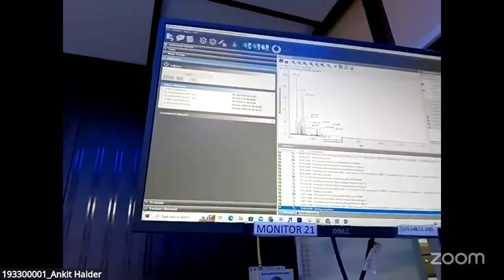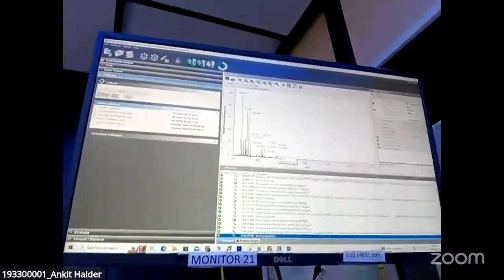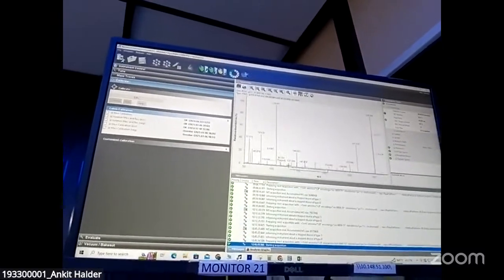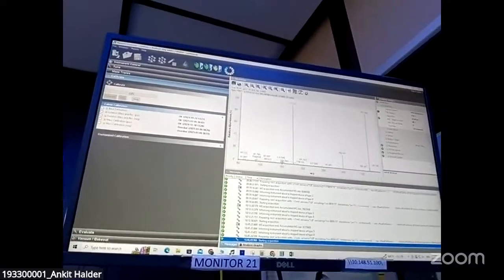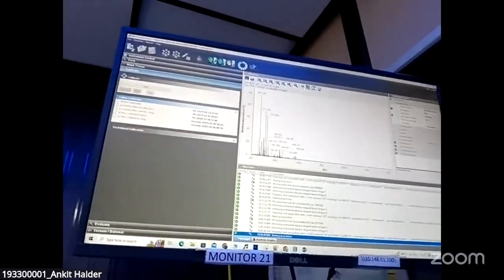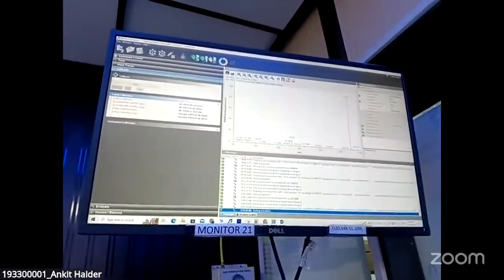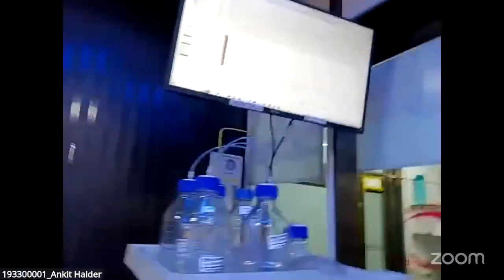This is how you can see the emission and the fragmentation that is happening, at this kind of high speed. You can see all the ions are getting detected in the analyzer and the detector, and we are getting the result. After this, we need the analysis in the software, where you access the database of m/z values to find and identify the compounds.